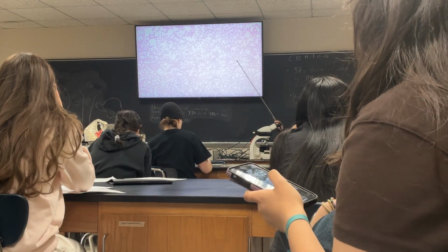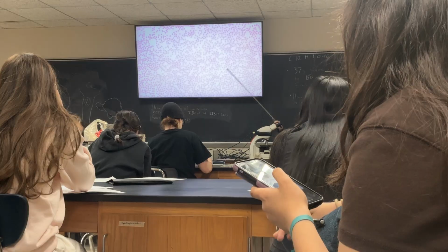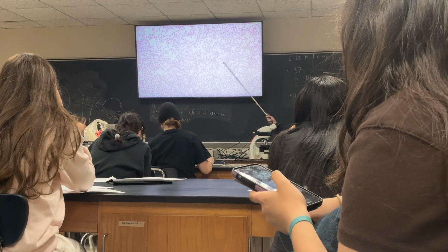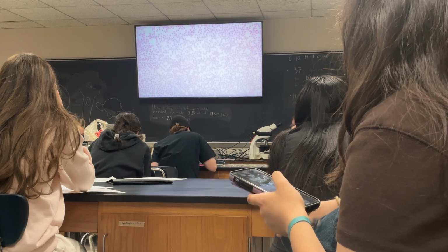Blood is the tissue, it includes all the white blood cells, the red blood cells, platelets, it also includes the plasma and dissolved things in it. That's all blood, right? The whole screen is all blood. Also on the screen there are just red blood cells.